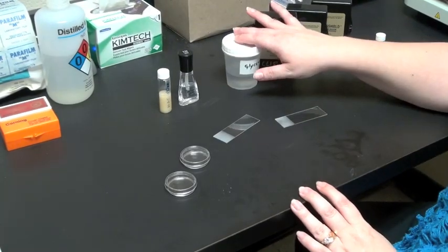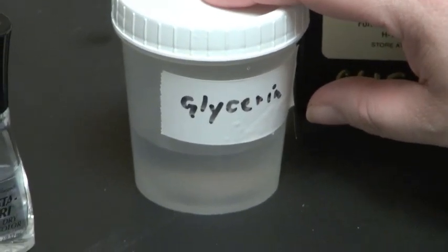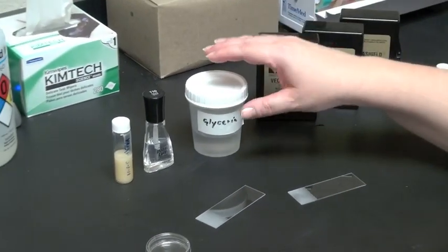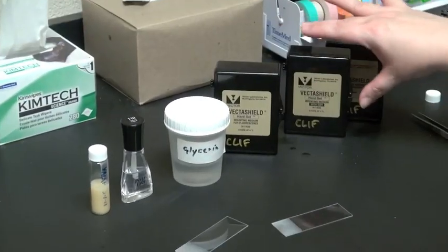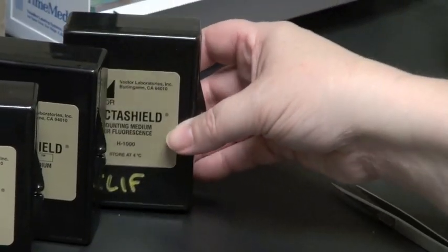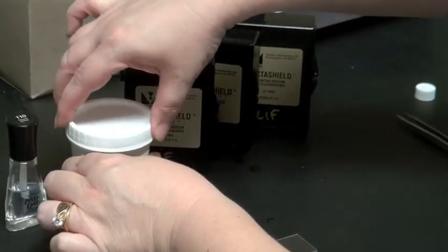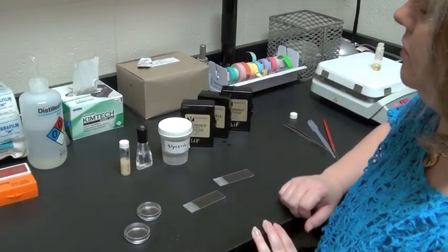So first you need to decide how you're going to mount your cover slip, what kind of mounting media you're going to use. You're going to need some kind of media between your cover glass and the glass of the slide, otherwise your cells will dry out. So options for this include glycerin or PBS glycerol, a 50-50 mix. There are also several different commercial mounting medias available on the market, including those that have DAPI in them, so they have stains in them to stain nuclei, or they can be wet mounts or hard set mounts for permanent cover slip saving. So today I'm going to be using glycerin, and you want to take your slide.